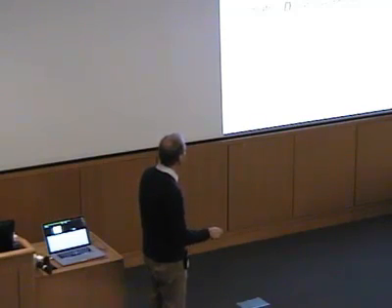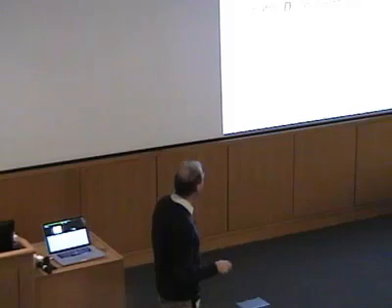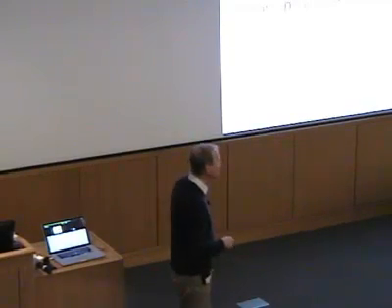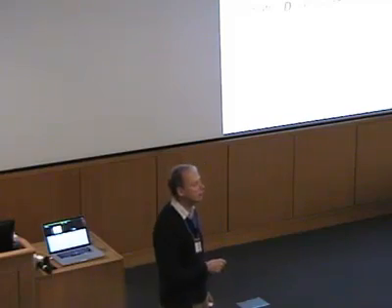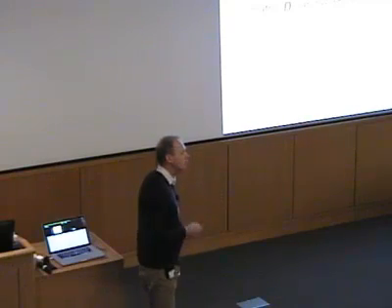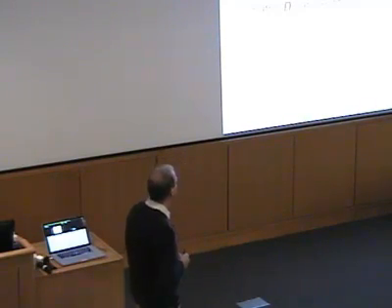So I would have diagonal elements, and the diagonal elements can be written in terms of two parameters, D and E. The notation here is a bit unfortunate. We use D for the whole matrix. We also use D for a parameter which is an element of the matrix and so on. But in any case, for most practical purposes, these two parameters, D and E, are what we use to describe the zero field splitting.